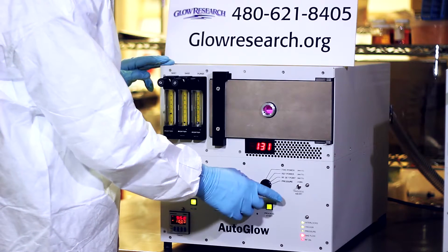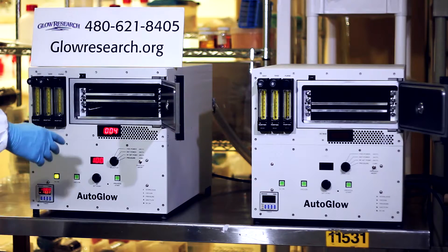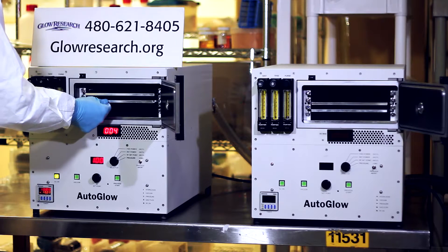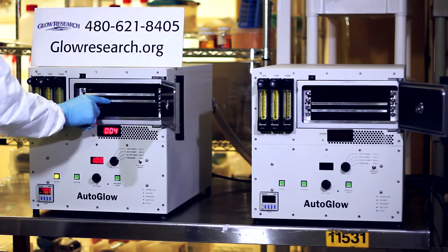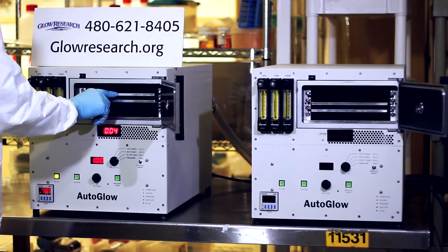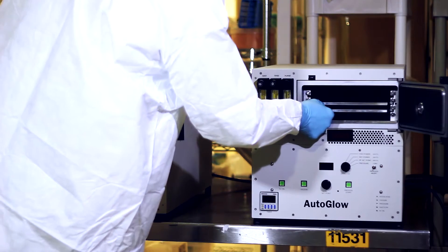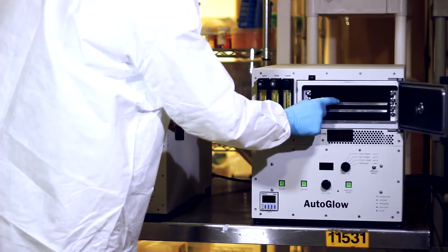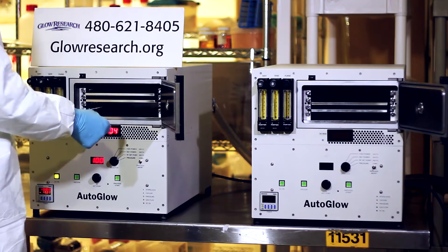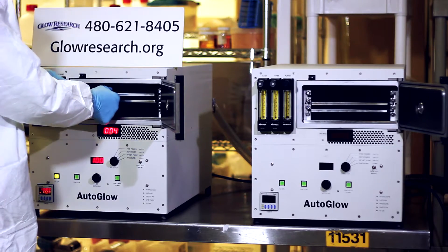The unique design of the Autoglow 200 chamber allows for various RF configurations. The center chamber shelf is the RF powered electrode. The user can place the grounded shelf above or below the powered shelf, allowing processing in a plasma mode or a reactive ion etching (RIE) mode. Options for the Autoglow 200 include a DC bias readout, which is helpful for etching applications, and an optional 600 watt RF generator for applications requiring more RF power.